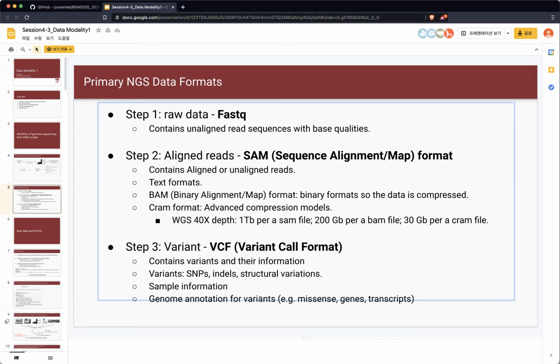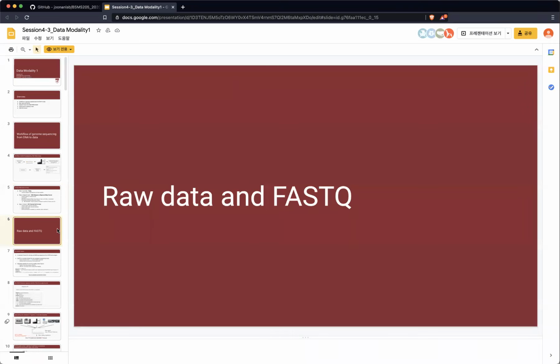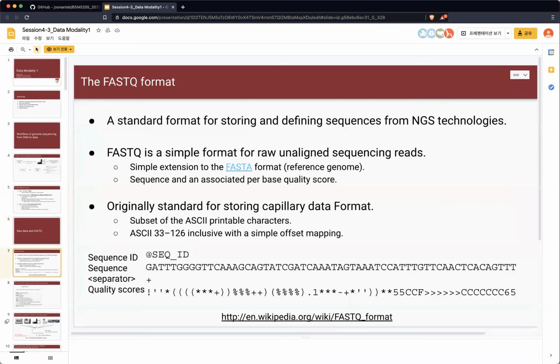Knowing about the data format and thinking about what the notation and format mean in the context of genetics and the polygenic model is a great starting point. You can learn about sequencing technology in your career. So we keep that notion and discuss how we understand the basic concept of the data format in NGS.